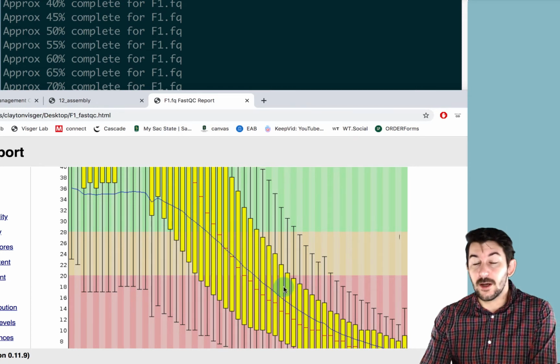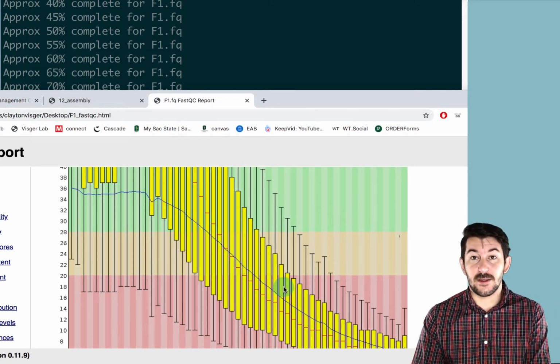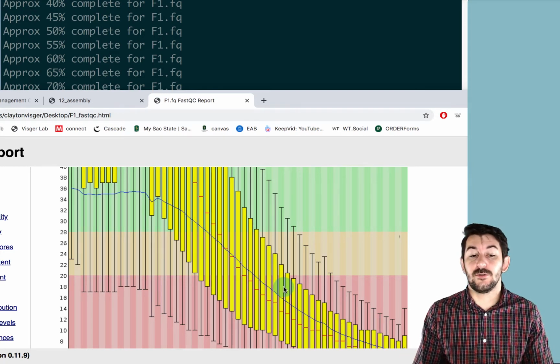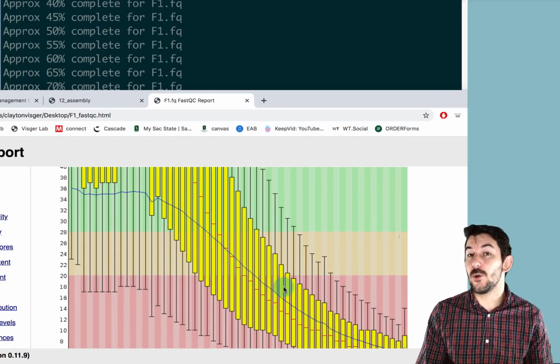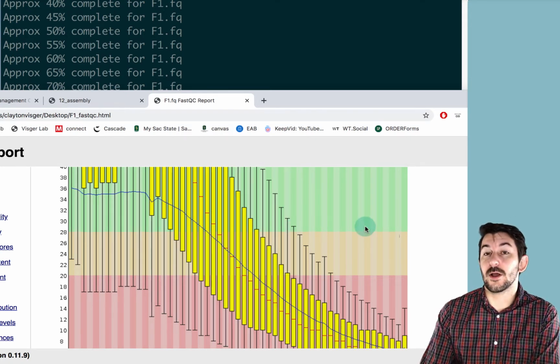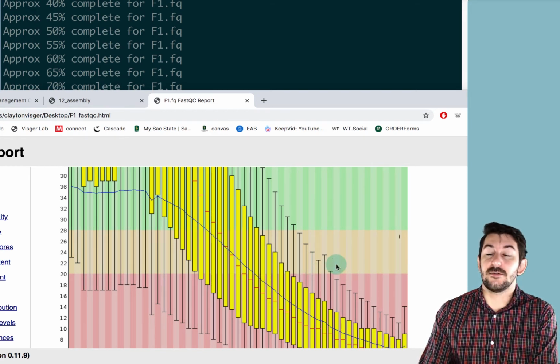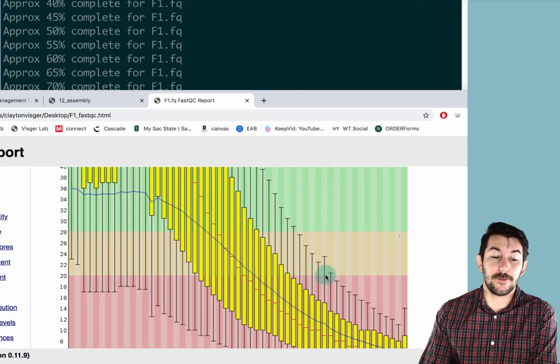So we're going to end up having to lop off probably half of these reads and make them much shorter. Now, there's trade-offs here. Do you want higher quality data, or do you want a larger volume of data? There is kind of a balance between those two things. Some information is better than no information. And so I'm definitely not going to do a 30 quality score cutoff for these. Maybe we'll do a 20, and we'll basically start cutting off the tail of a lot of these where it dips below 20.